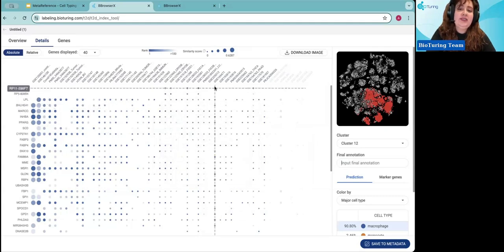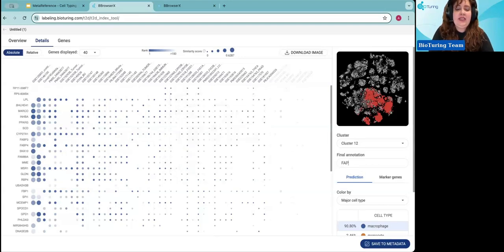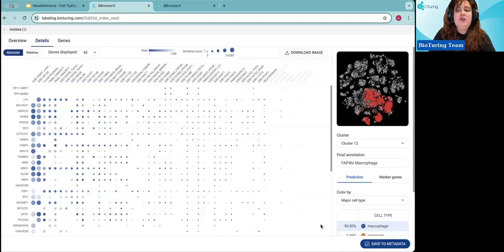Dataset GSC169471 directly replicates the same analysis found in the author's original publication. You can add the annotation — for example, FABP4-high macrophage — and once you have it, save it in your metadata so the final annotation is applied to the original network cluster-based analysis. This lets you verify that cluster 12 is specific to this FABP4 characterization.